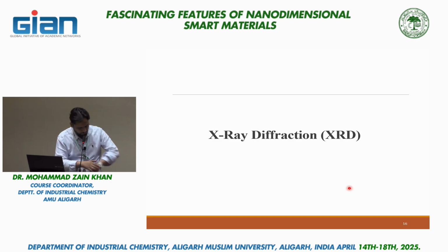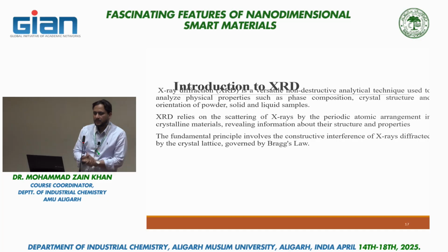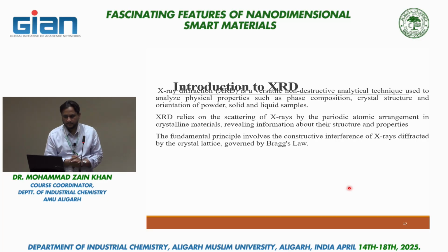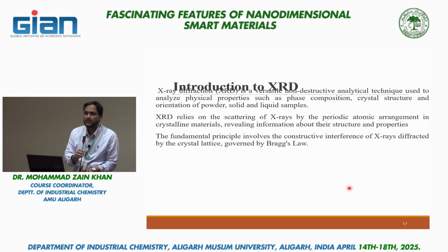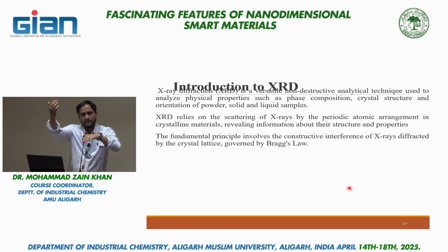Now XRD, X-ray diffractometry. I told you that in this technique, X-rays fall on a sample, and when they fall, they get diffracted.